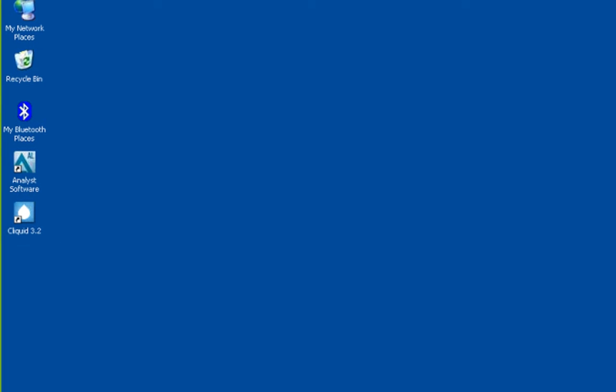To launch the Qlikwid software, simply double-click the icon on your desktop.